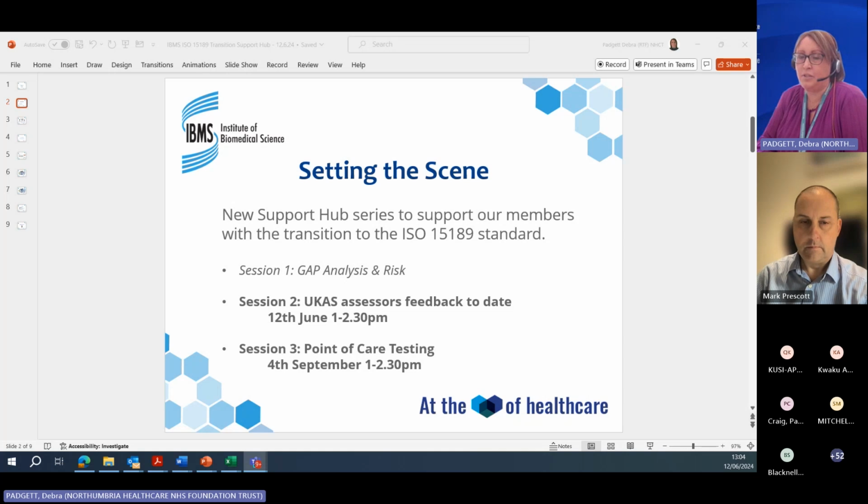So that's today's session. Mark's also then going to talk to us about LIMS. I think we've had lots of questions about laboratory information management systems and how they go through that transition process, especially because a huge number of us are either just delivering our LIMS or about to go through that process of the huge change to the way we manage resulting and result transmission, and so really looking at that as part of the process as well.